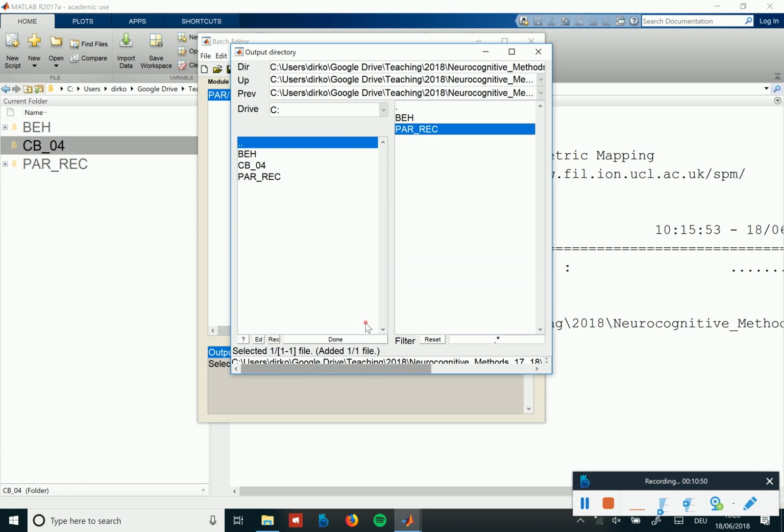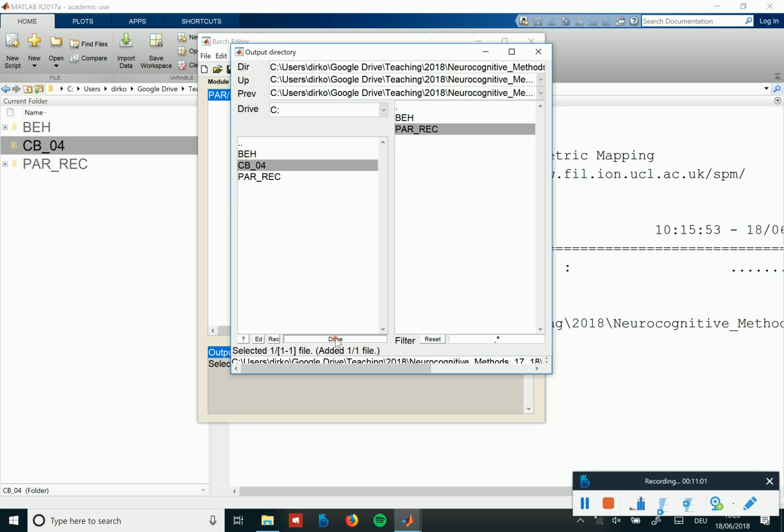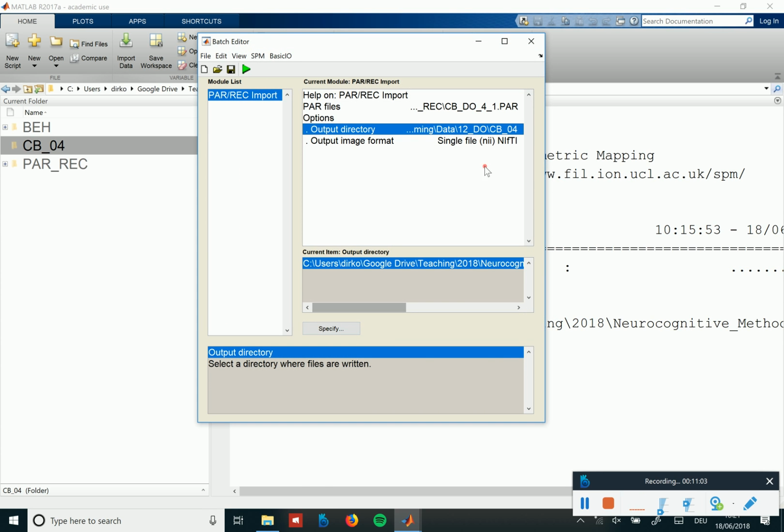And this is again with this a little bit weird interface. It always puts things here. You can get rid of them by clicking on them for whatever reason, but now nothing works anymore. Where is it? There. Now it's there again, and when you're done, you click done. So this is how you go through this GUI, and you should avoid going through the GUI and only when you first set up scripts for something does it make sense to go through this. Otherwise, you should not do it, because it's just annoying and you get crazy.